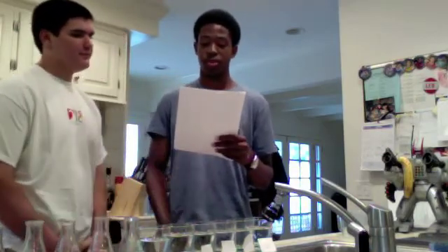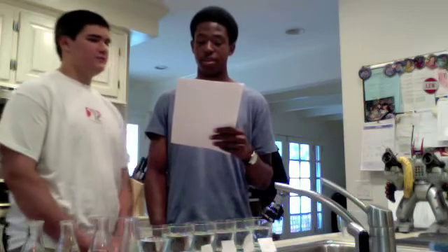You find the mass difference by subtracting the first mass from the second mass. You find the percent change in mass by taking the mass difference and dividing it by the initial mass, and then multiplying that by 100. In the bag with the distilled water in it, the first mass was 15.97, the second mass 16.45, a difference of 0.48 grams, and the percent change was 2.9%.